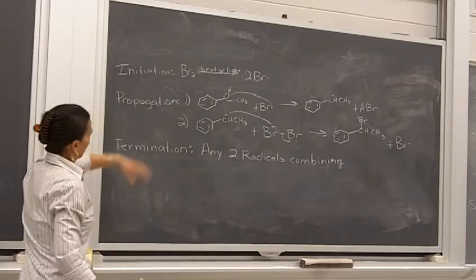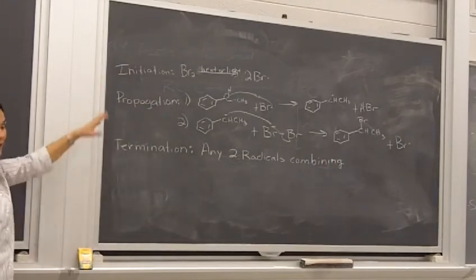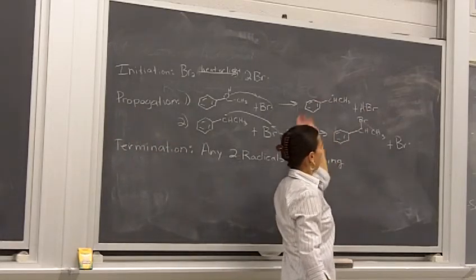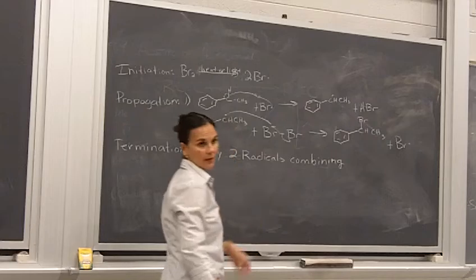And so once we get our benzoyl peroxide going, we get this whole situation going, and then eventually it starts dying down because we get our product forming and we don't have more NBS to be thrown into it, and we don't have more ethylbenzene to be reacting, okay?